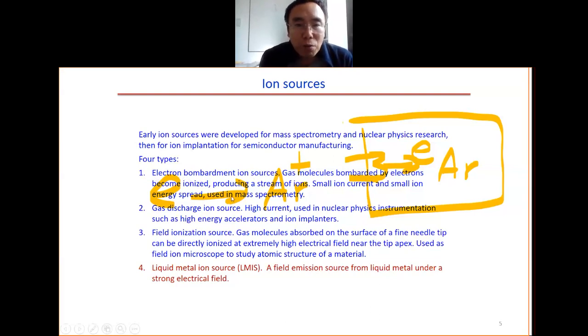So this one is used for mass spectrometry. What mass spectrometry uses the ions? If you remember, one of them is called SIMS.